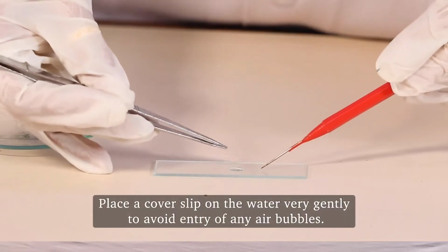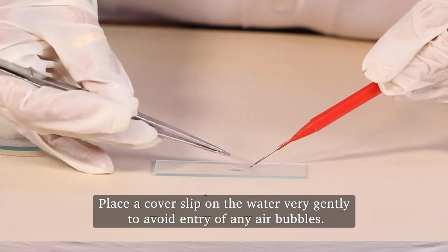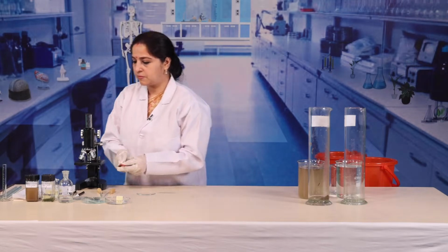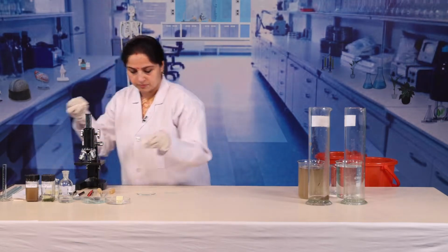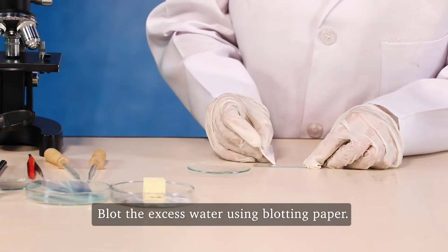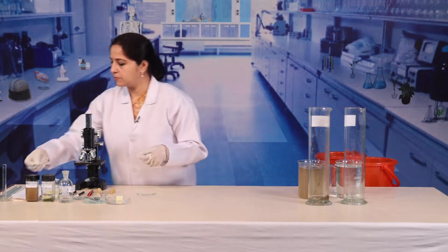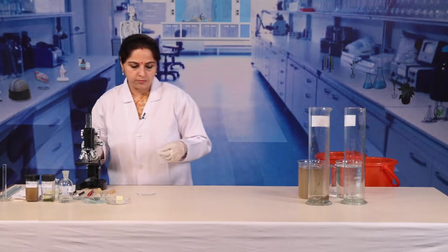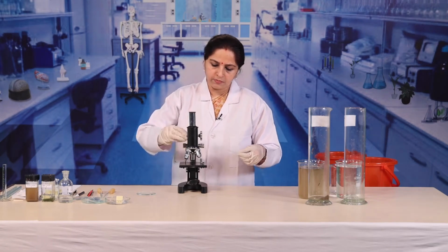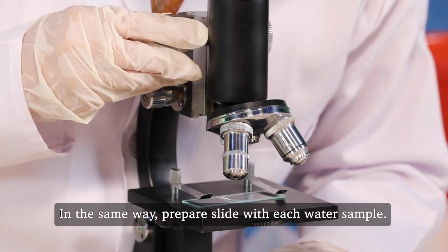Place a cover slip on the water very gently to avoid the entry of any air bubbles. Blot the excess water using blotting paper. In the same way, prepare slides with each water sample.